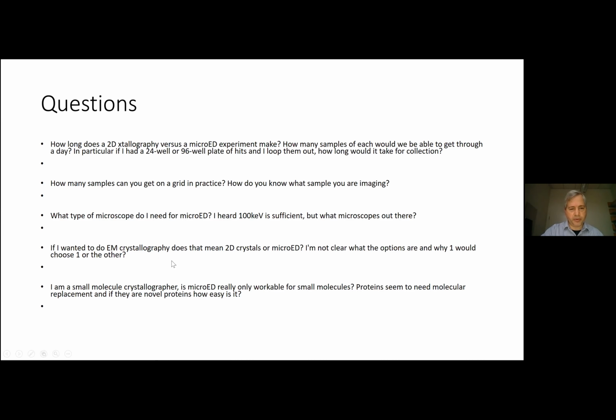So I sort of went through crystallographies. MicroED is not only working with small molecules. With proteins, with MicroED, you still have the phase problem that X-ray crystallographers have. You have to figure out the phases because you're only collecting diffraction patterns. For proteins right now, there's nothing analogous to X-ray MAD or SAD phasing, or heavy atom replacement, where you can figure out the phases that way. So the only way is molecular replacement.